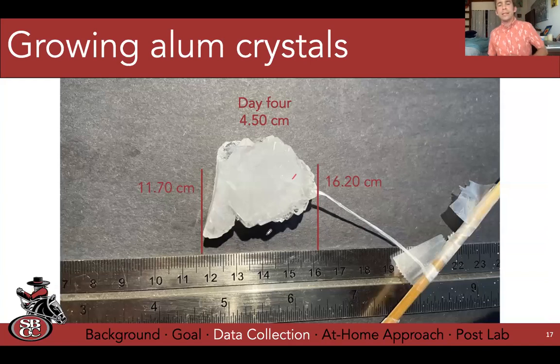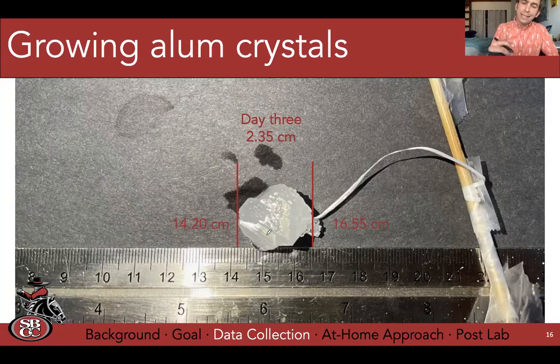On day 4, or on day 3, I guess, I changed up my procedure a little bit, and I started putting my hot saturated solutions in the microwave. So I would use hot water and get it till it was just about saturated. Then I would put it in the microwave until it went clear. It'll boil and you'll actually see it go clear as the water heats up and the solubility changes. You might have to take it out and stir a little bit. Then I added a little bit more alum on top of that, and microwaved it a little bit more.